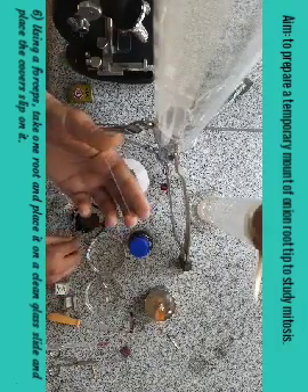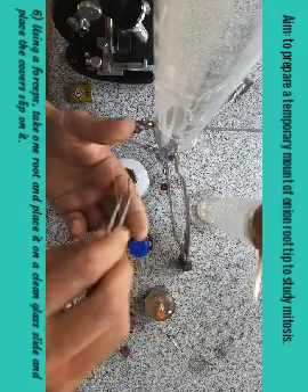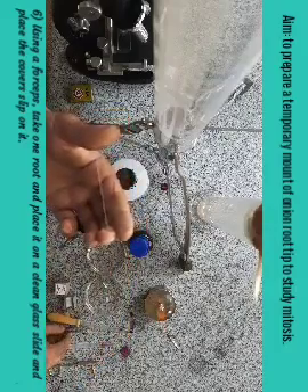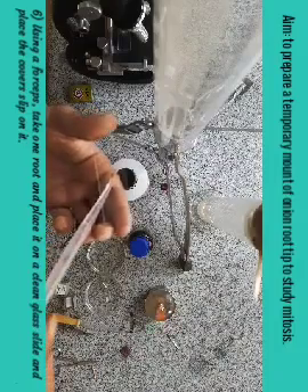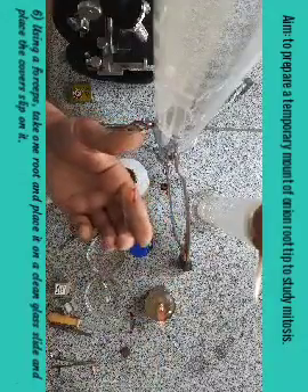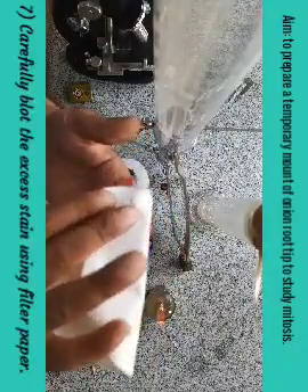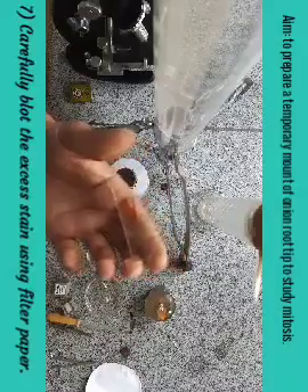After three minutes, take the glass slide, clean it, and take the root tip which you have kept in dye for three minutes and put it on the slide. After placing it on the slide, put one drop of distilled water over it to release the extra stain. Now take the cover slip and put it on the root tip on the slide like this, and take the blotting paper to wipe out the extra material or extra stain. Our slide is now ready to be observed under the microscope.